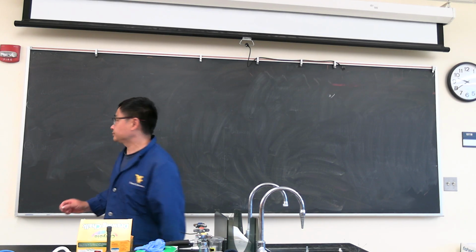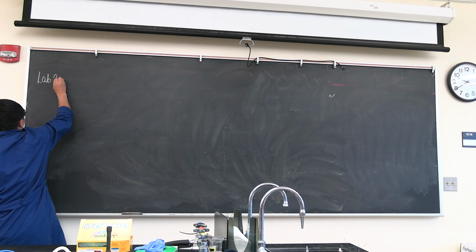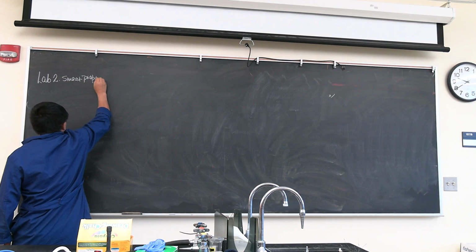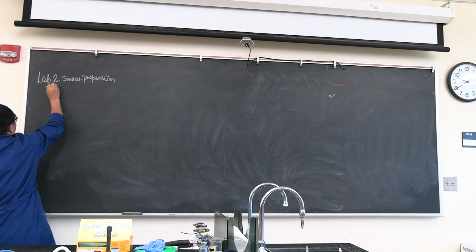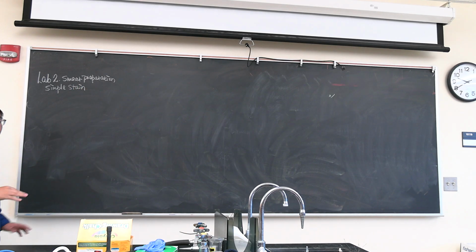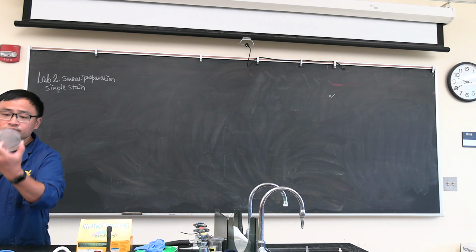Okay, let's start the class, and we are going to do the second lab. Second lab, we move to smear preparation and simple stain. And this is going to be the first time you really touch the bacteria. We'll try to make it simple, so what you will have is E. coli.